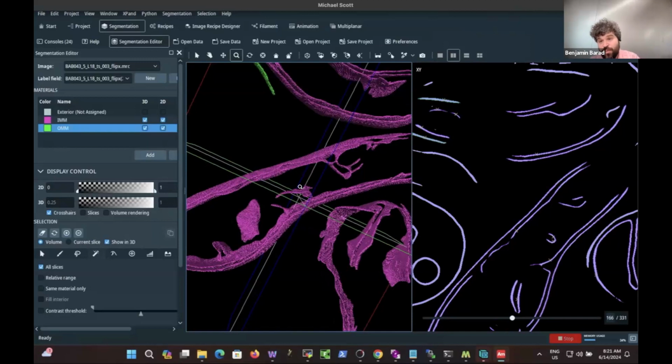We then do reconstruction with Warp and make half maps and then do denoising with cryoCARE, which is a denoising algorithm. We then sometimes will also pass it through IsoNet to do missing wedge correction. And then from there, it'll go into MemBrain-seg, which is different from MemBrain-pick. And that's the segmentation that I'm painting in right now. Right.